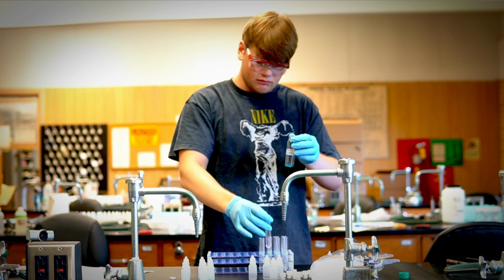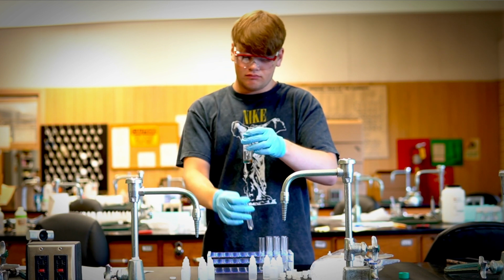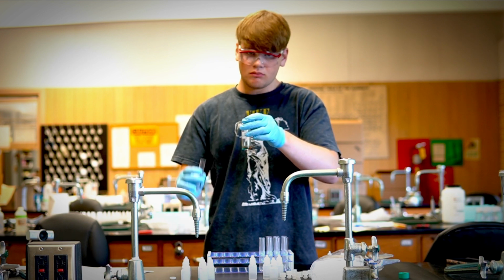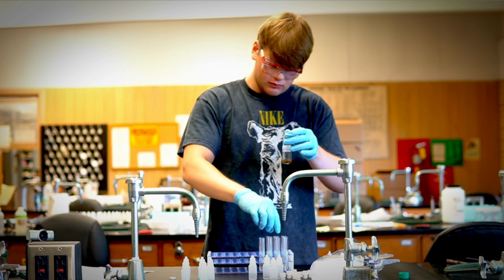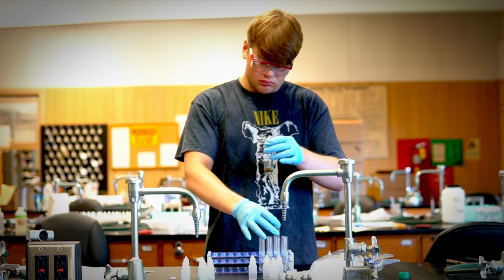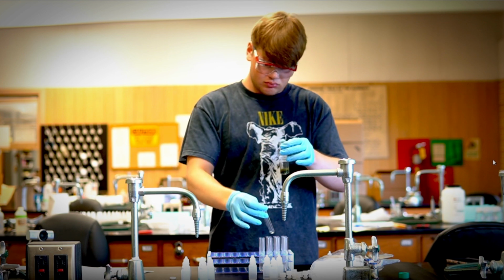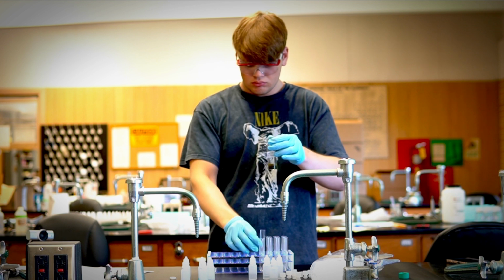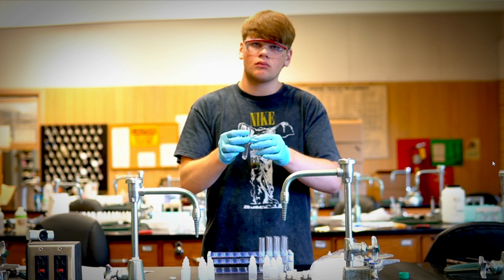You're wearing your goggles, your gloves, you're working in a well ventilated environment, and you are not touching any chemicals, you are not testing them, you are not spilling them, and you are not using anything that will put you in any danger. Safety is number one when it comes to lab experiments, before anything else.